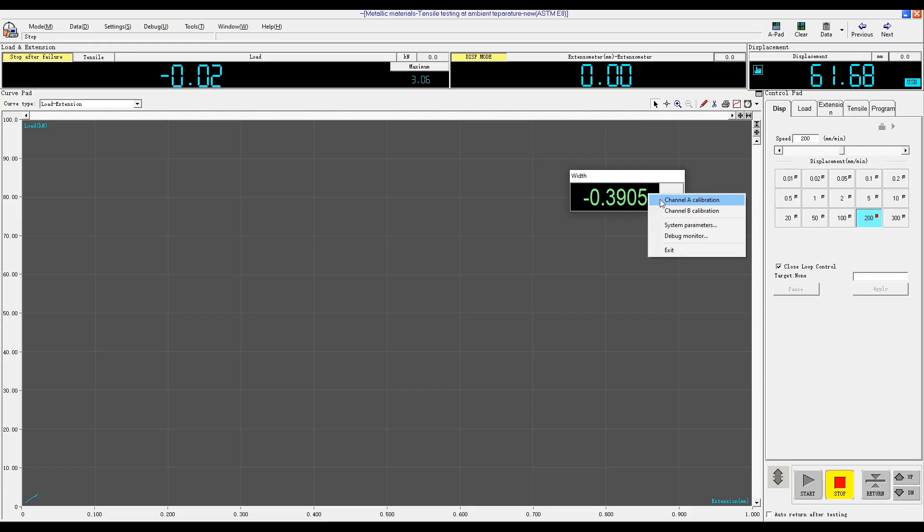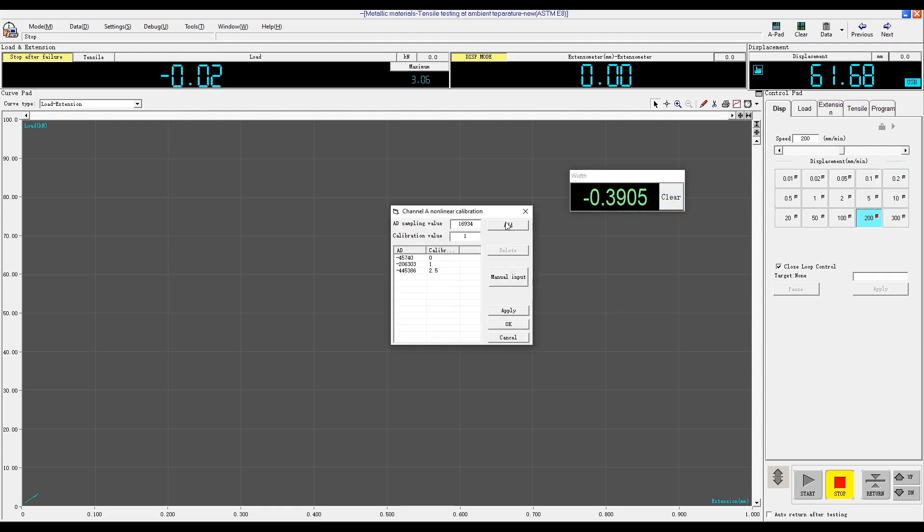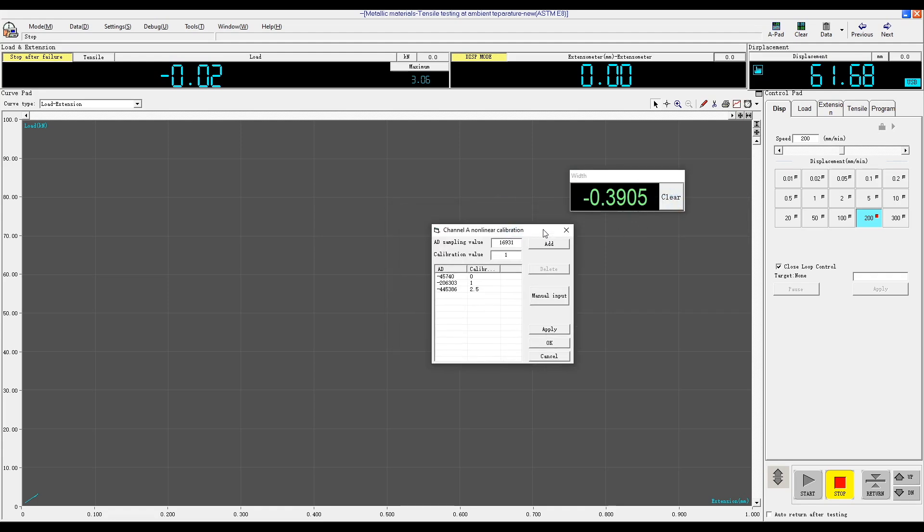Calibrate to 0.5 millimeters and click Add in the software. 1 millimeter, 1.5 millimeters, 2 millimeters, 2.5 millimeters. After adding all of the points, click Apply and click OK.